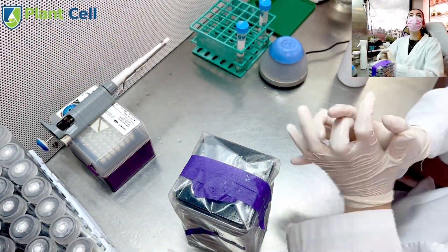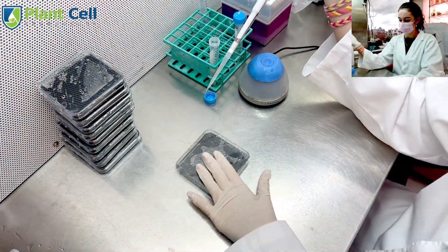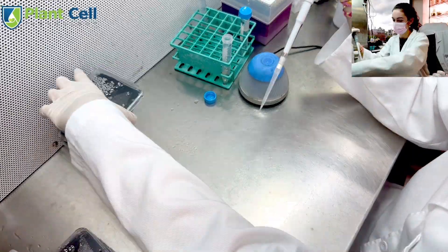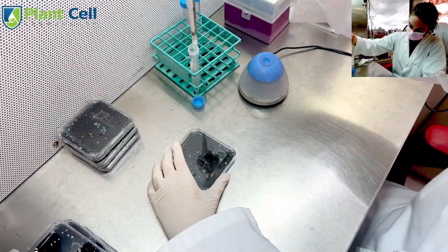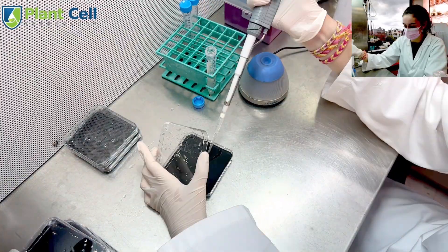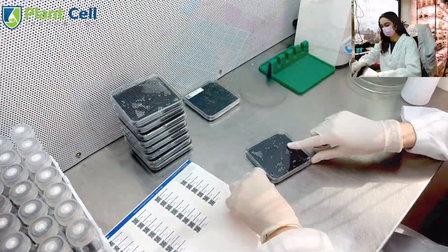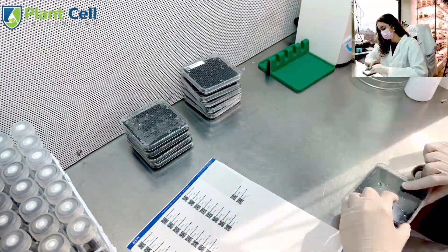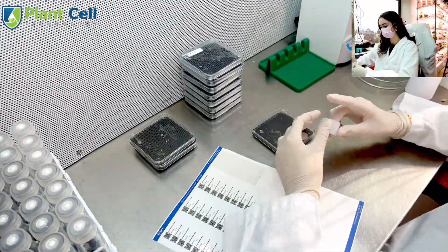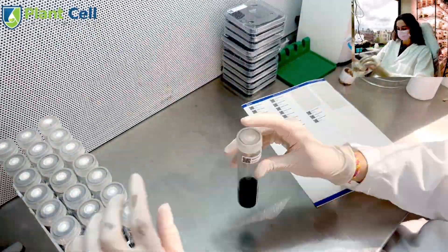I had some seeds left over, so I decided to put the rest in sterilized petri dishes. I added 1 ml to each dish and even had some left over, so I added an additional ml to some of the dishes. Once I was finished, I put saran wrap around the petri dishes to prevent contamination. I also added barcode labels to all the dishes and test tubes so we can document the seed growth.